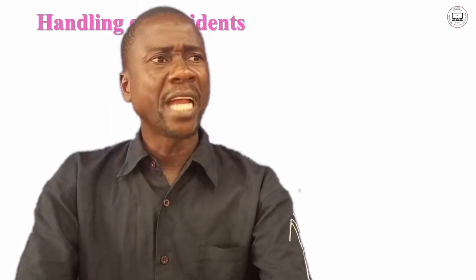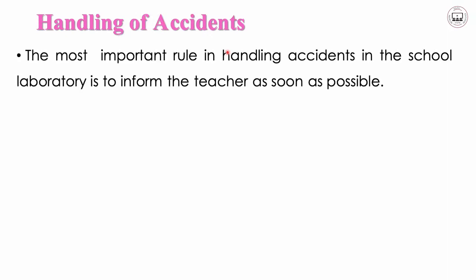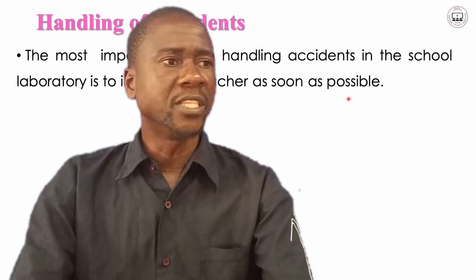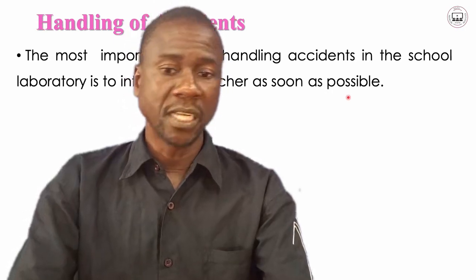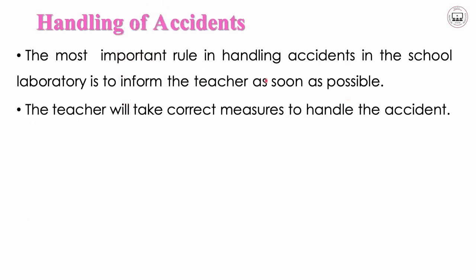Now, how can we handle it if we happen to face such accidents? I want us to learn about handling accidents when they happen in a laboratory. The most important rule in handling an accident in the school laboratory is to inform the teacher as soon as possible, or any instructor who is with you in the laboratory. If that is not a teacher, you may sometimes have laboratory assistants. So it is all important. The teacher will take correct measures to handle the accident.